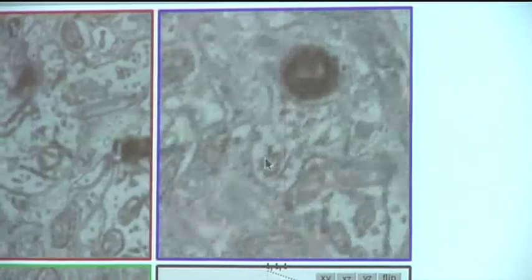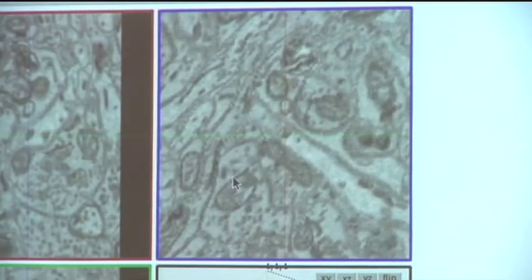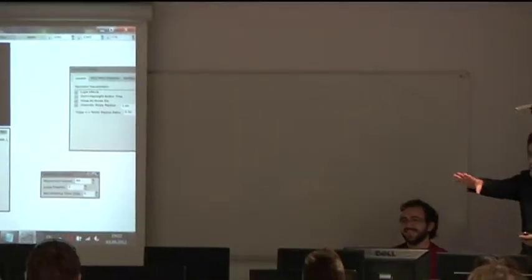For the mitochondria there. Yeah. Which one? Yeah. This one. See, that was a minute because of factor of 2. No problem. I didn't show you.